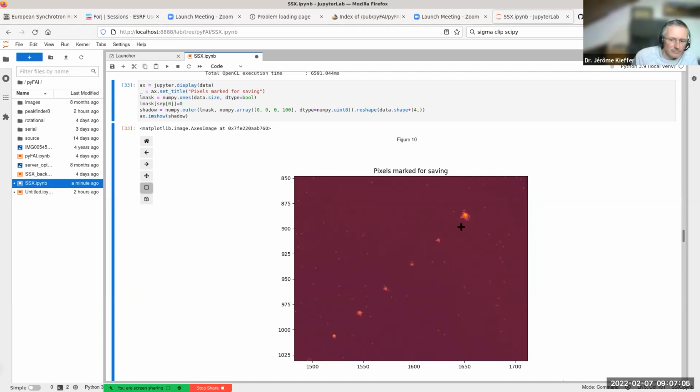Yes, Alexander. So several questions, sorry. You process this image for 80 milliseconds, so basically you can process like 12 images per second from 2000. So it doesn't help you to basically transfer data. Well, the figures that you are seeing here are on my computer.